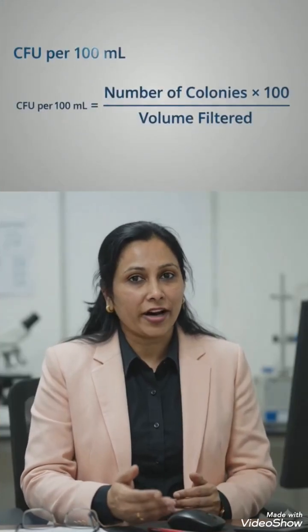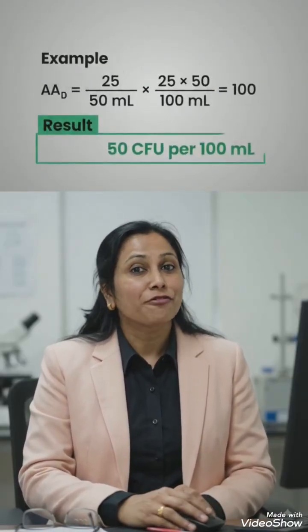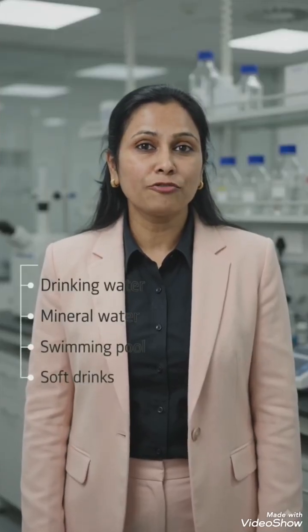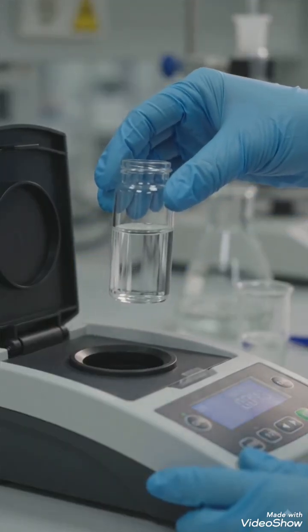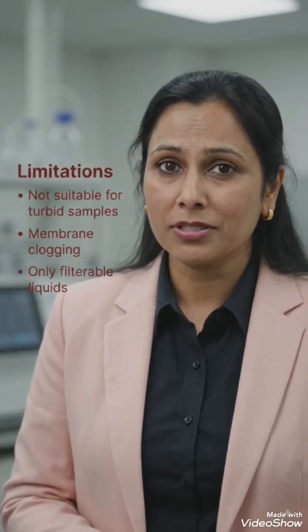Use this formula to find it. For example, 25 colonies gives 50 CFU. This method is highly suitable for water samples containing low numbers of microorganisms. This method offers key advantages. It is sensitive and rapid and is accurate. However, there are limitations. It's not for turbid samples. Membrane clogging can occur. The most probable number method is a statistical technique.